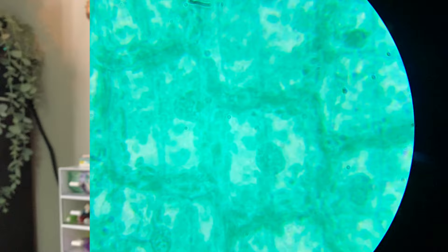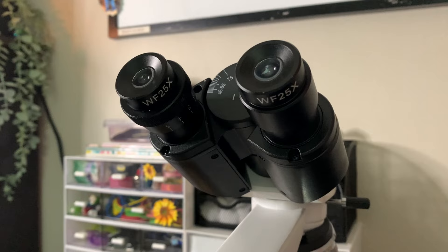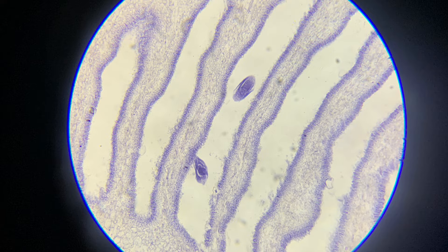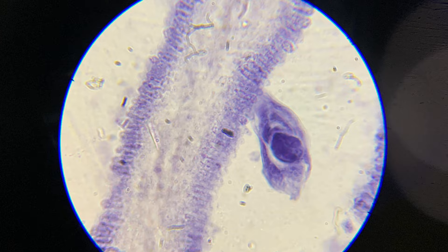Now we'll be observing with the wide field 25x ocular. You can see where it is, but it's extremely blurry — it's extremely blurry.